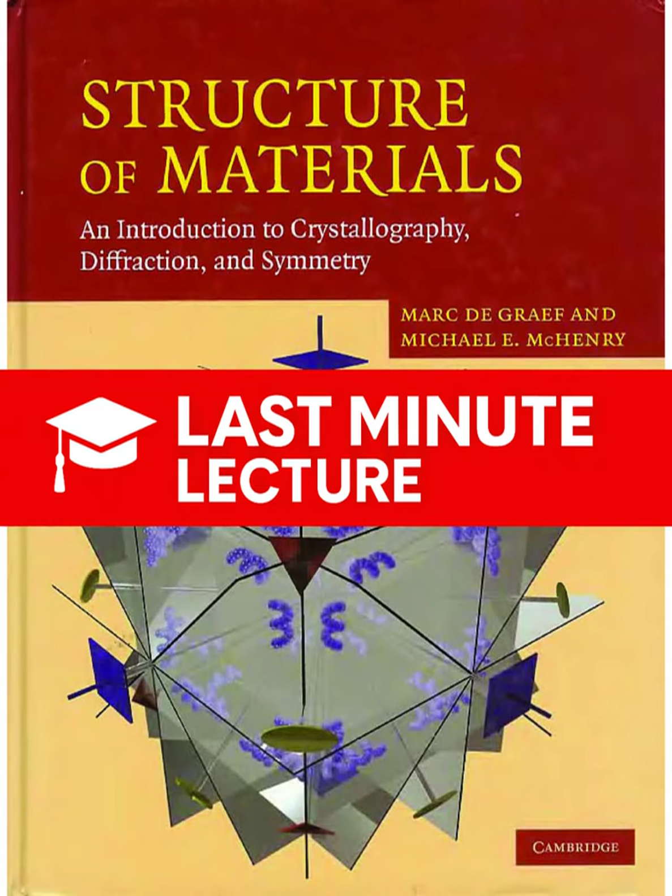But how on earth does a crystallographer decipher this complex pattern of dots to figure out the crystal's orientation? It requires sophisticated tools like the Greninger chart. The core challenge is converting the 2D spot locations on the film into a 3D description of the crystal's orientation. The Greninger chart lets you map the spot positions onto stereographic coordinates, which is just a standardized way to map the 3D angular relationships onto a flat 2D projection.